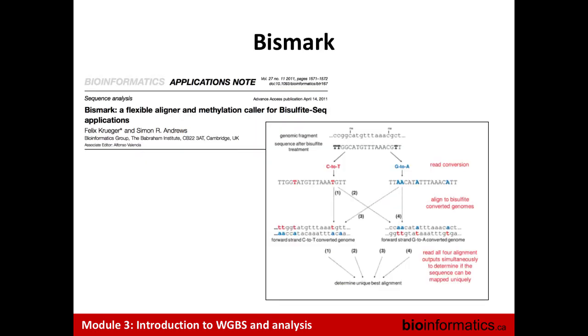Yes, it keeps the original sequences. But a lot of times it's the converted reads that are also interesting to look at when you want to see exactly what the data looks like.